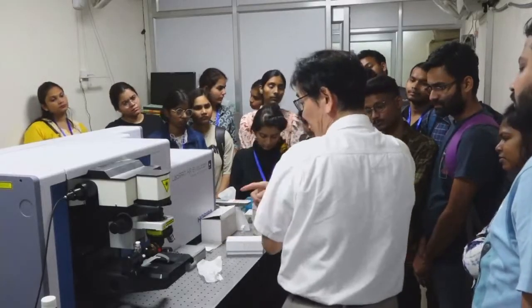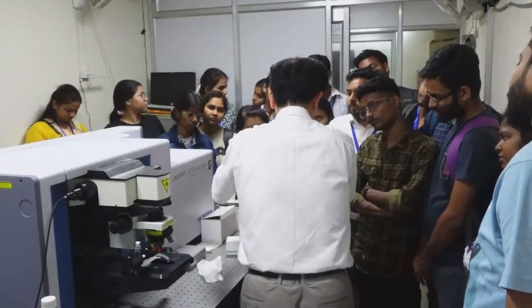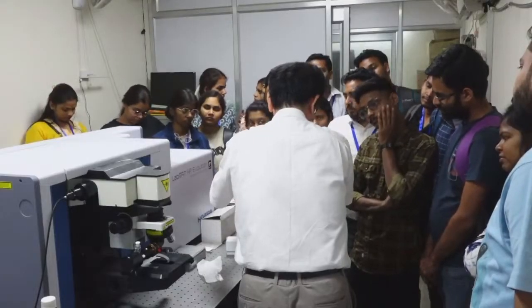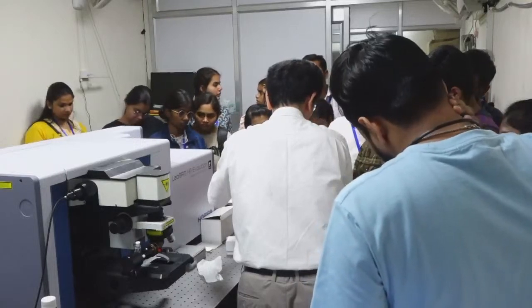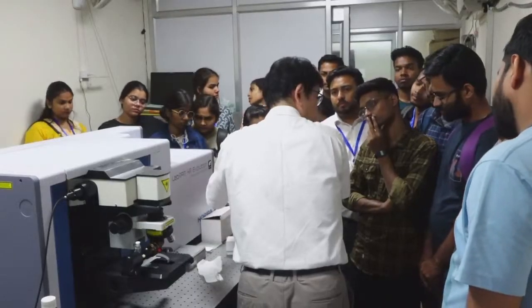But a good point of this configuration is that once the focal point is fixed, the collection position of the lens is automatically fixed to the appropriate position to collect the signal.